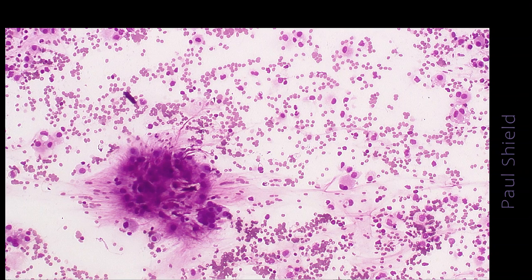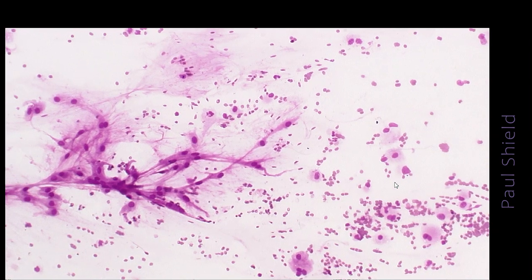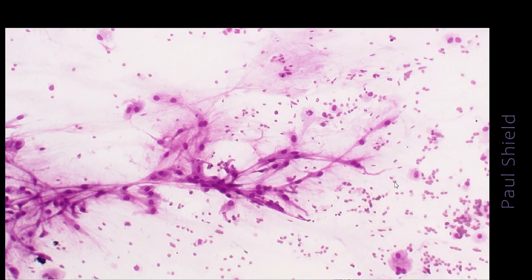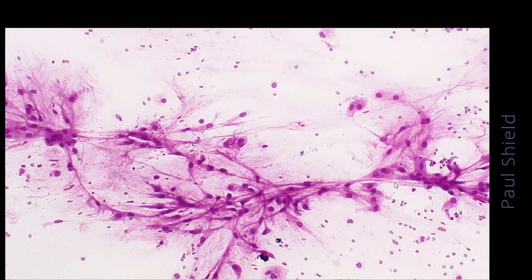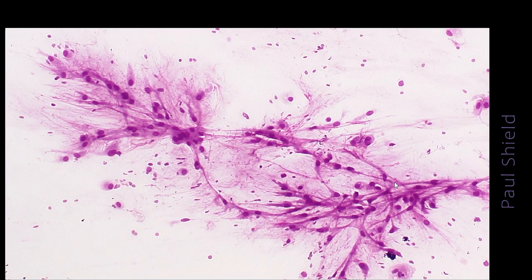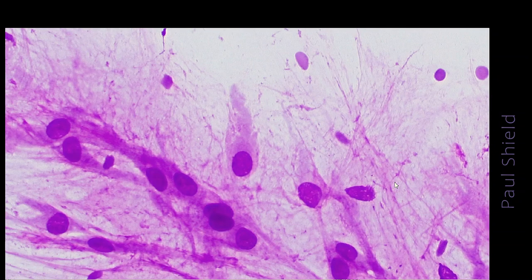Here we have a Diff-Quik, and you can see a clump of mucus present there, staining kind of magenta-y and fibrillar in the Giemsa stain slide. Got a background of what appear to be mesothelial cells. Here's some more stringy sort of mucin with cells in amongst it. I'm not really sure, to be honest, what they are. I think they are probably macrophages, but they could be tumour cells.